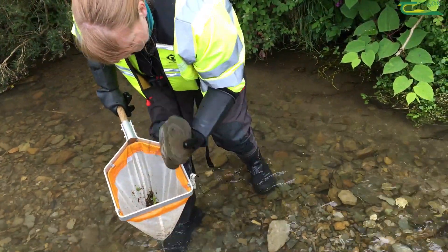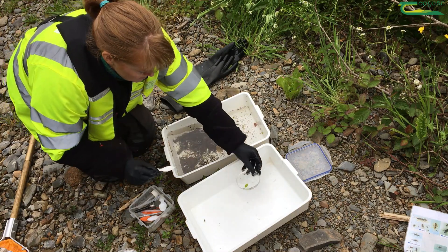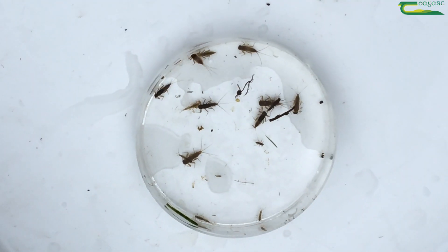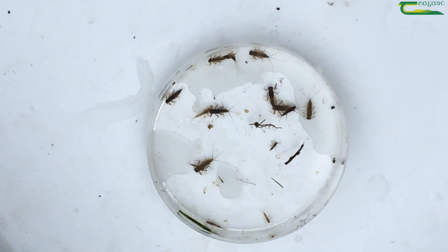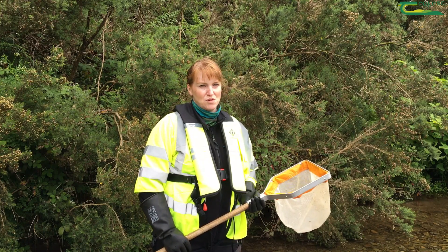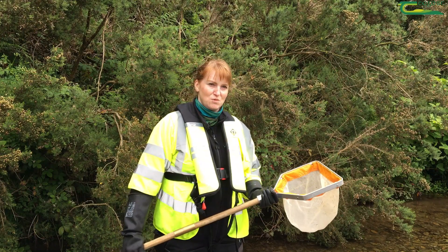What I'll be looking for today is to see if I can find sensitive species like mayfly and stonefly, and they will give me a good indication that the water quality is good. There are other less sensitive species that are more tolerant to pollution, so they survive in more polluted waters. This test gives me an indication of the water quality.